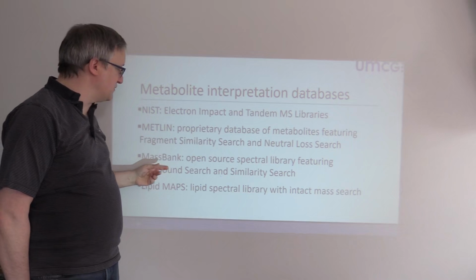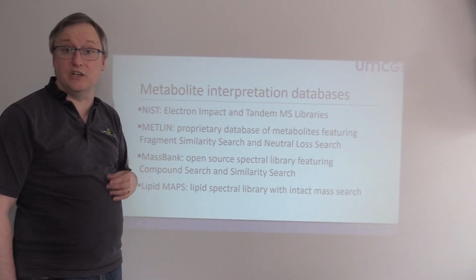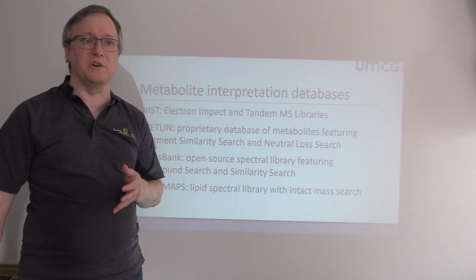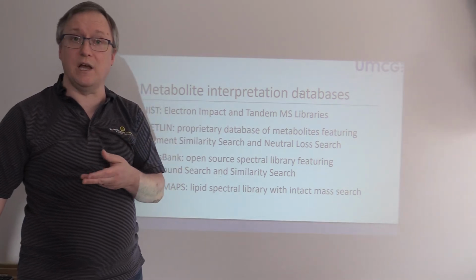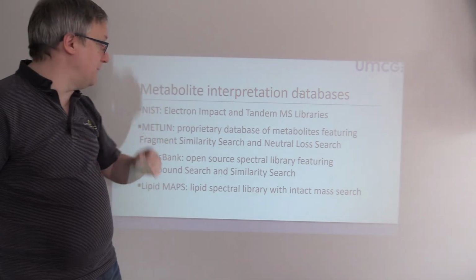Okay, there was a big resource that started as MassBank in Japan, a really great database, very much focused on open data. There's now a mirror of it here in Europe, I think massbank.eu, created by Stefan Neumann's group.